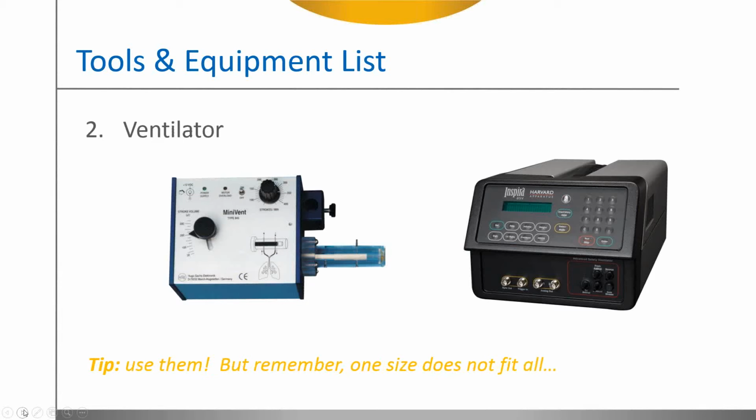For most injectable anesthetics, the use of a ventilator is going to improve stability of the hemodynamic variables. Ventilators will help control the artifacts caused by gasping during study in many cases. When performing mouse studies, it is best to use a ventilator that is optimized for the small size of the mouse. One size does not always fit all.